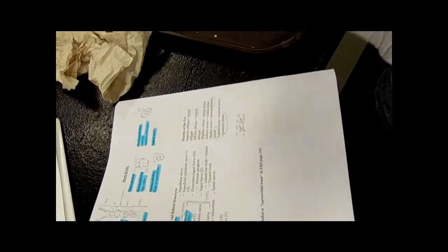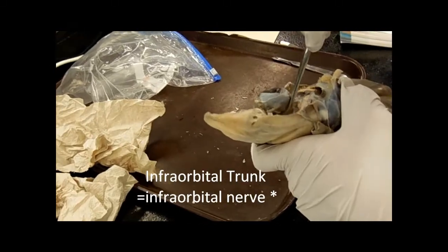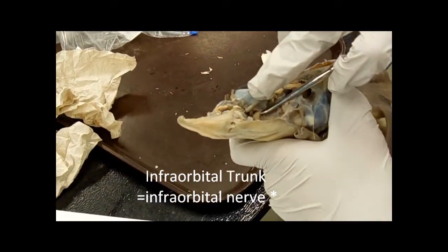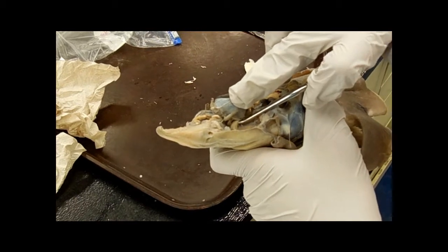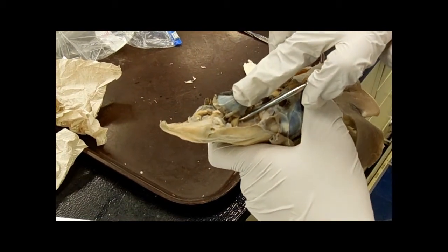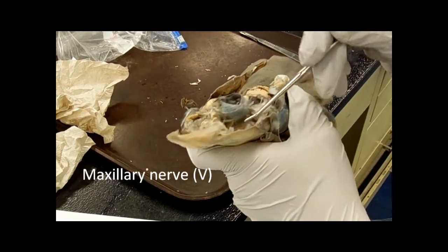And then the last two nerves that you have to know. You can see that really big chunk of nerve right there, this one. This is the infraorbital trunk, or the infraorbital nerve, and it branches off into two sections.